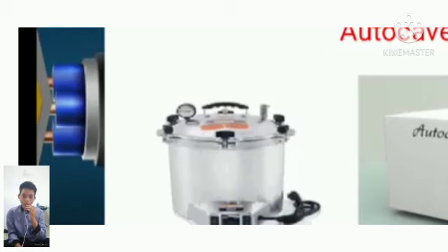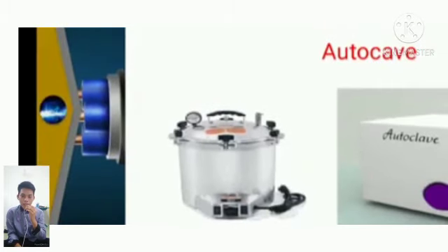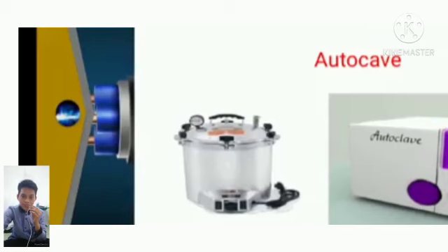This type of autoclave has a shape like a tube that is quite elongated upward. The volume of these types of autoclave is influenced by the diameter and height of the autoclave itself.